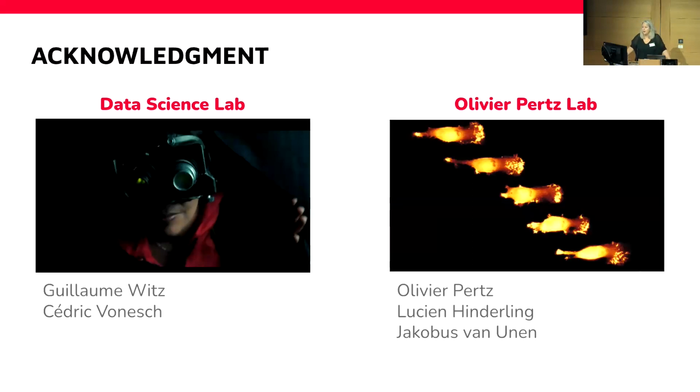So this is to say that we don't produce our data. And I also want to acknowledge that because I joined only 6 months ago, I haven't done most of what I will present today. So I'm very honored that I can present the work of our lab. For the data, we rely on collaboration with scientists, and one of our main collaborations is Olivier Pertz's lab.